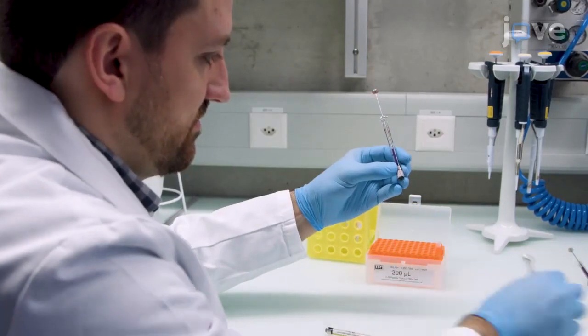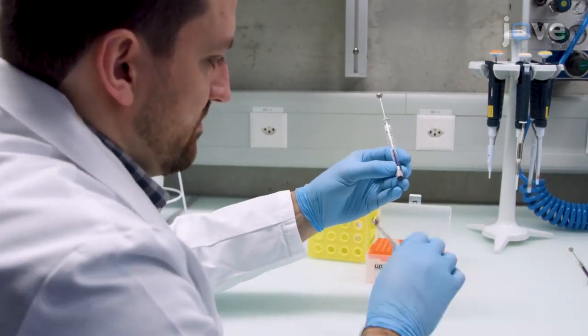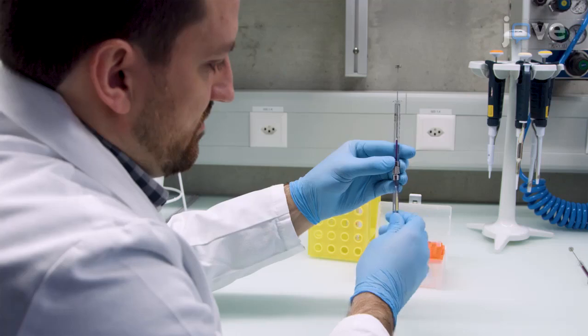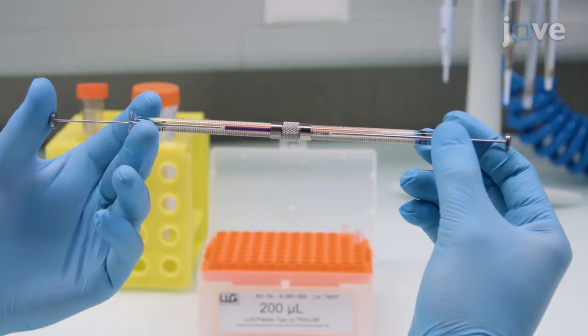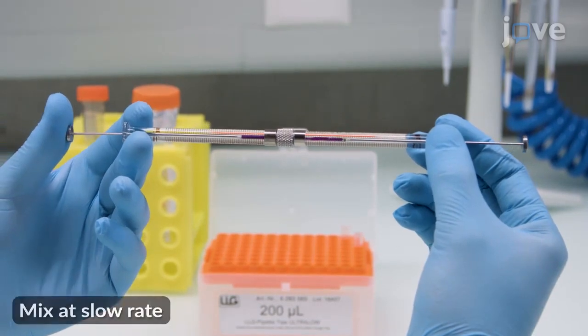Remove the empty syringe from the coupler and attach the pre-mixed LCP to the crystal containing syringe using a standard syringe coupler. Then, pass the sample through the coupler 100 times.